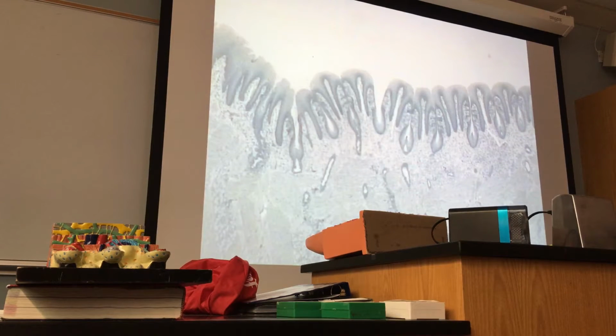And what you see by the side of the groove, these are taste buds. These are called taste buds. I'm going to show you. Taste buds.